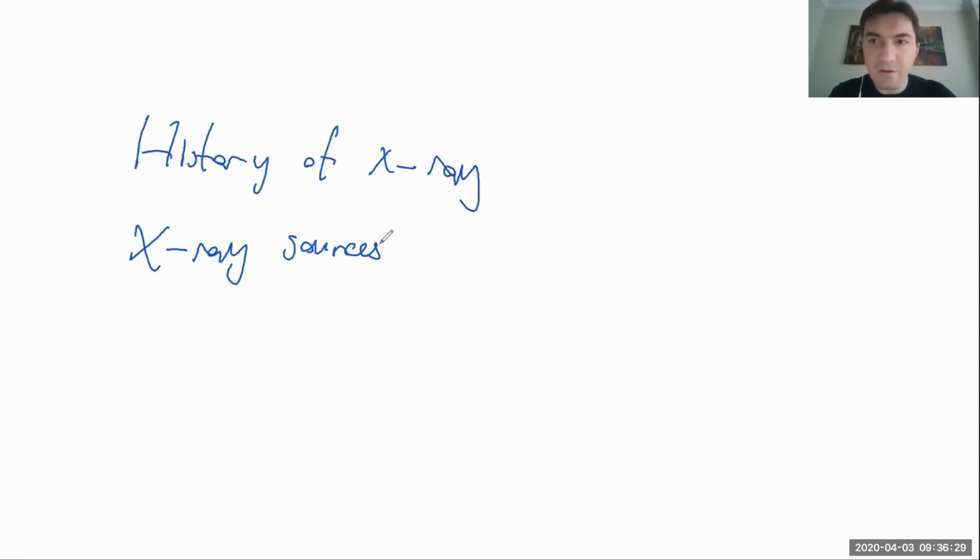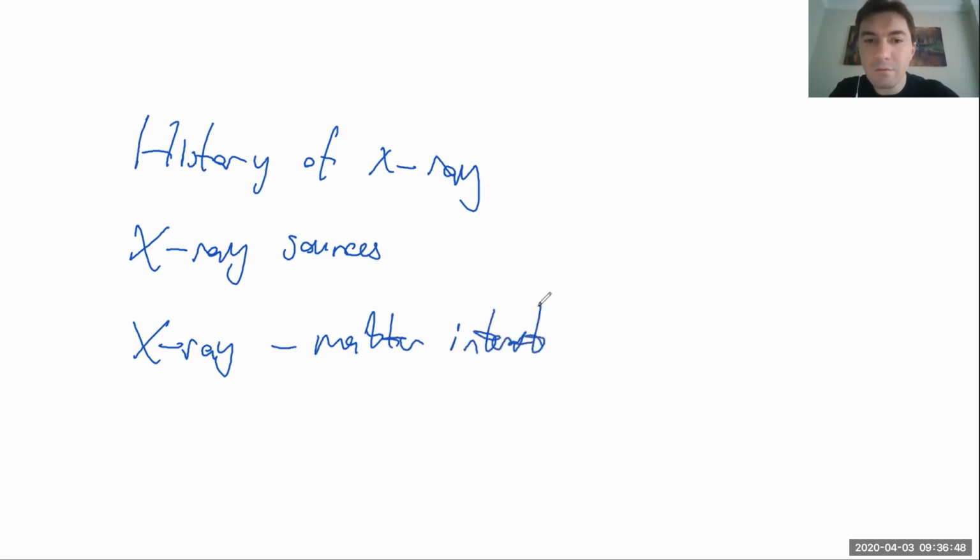We have seen all of the X-ray sources, even old ones. And we have discussed X-ray matter interaction. We have seen absorption and scattering mechanisms.